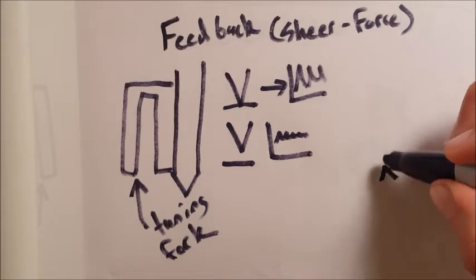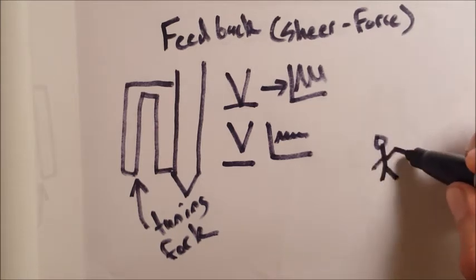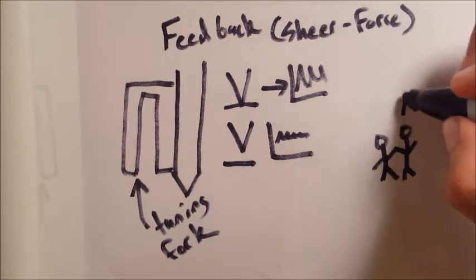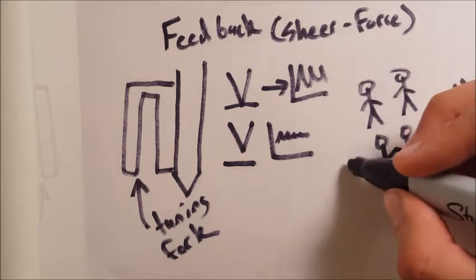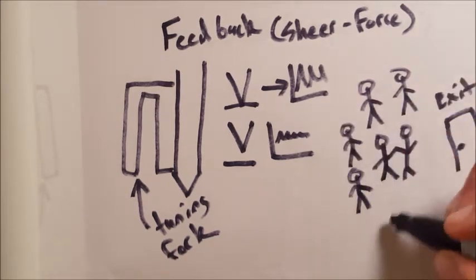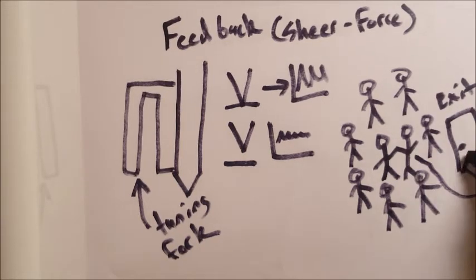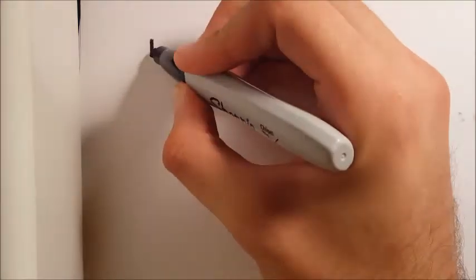tuning fork. A simple analogy that shows the relationship between the tuning fork and the probe would be you are feeling sick at a party and need a friend to lead you to the bathroom. Unfortunately, the party is filled to the brim with people. Your friend, as the tuning fork, lets you know where to move when you get way too close to another person so you can easily get to the bathroom and throw up.